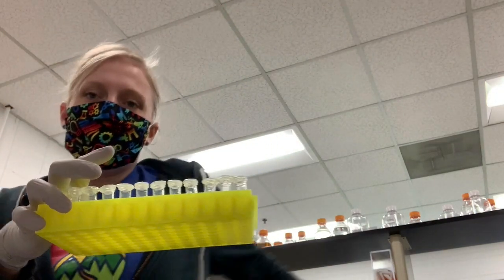Okay, so it's been 15 minutes. I'm going to get my samples out of the 37-degree block. You can turn the block off after you're finished, and you can put all of your samples on a tube rack to bring back to your bench.